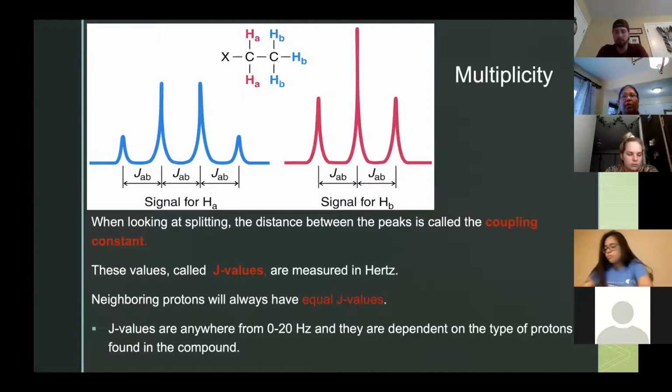So you are responsible for the chemical shift, where you are on the x-axis, but your neighbors are responsible for you splitting up like this. Do you understand? The peak itself is indicated by the value of the chemical shift on the graph, but how they split is because of their neighbors. Okay, so keep that in mind.